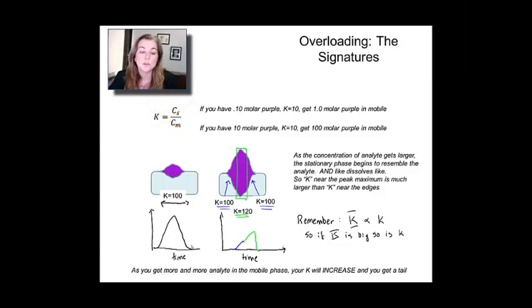But the problem is that here's a case where you don't have a lot of analyte present in the mobile phase, and so you get a nice uniform distribution out, because the partition coefficients from the tailing end and the leading end of the peak are all identical.